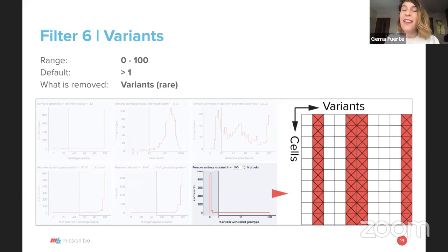If you are expecting a very low frequency mutation in FLT3-ITD, or you want to see a very rare TP53 mutation and you expect it in 0.5% of the cells, let's just create a bed file and import it into Tapestri Insights, and you only see that region. So you get all the variants within the coordinates that you have imported, and you don't get distracted with the 10,000 or 15,000 potential false positives from GATK.